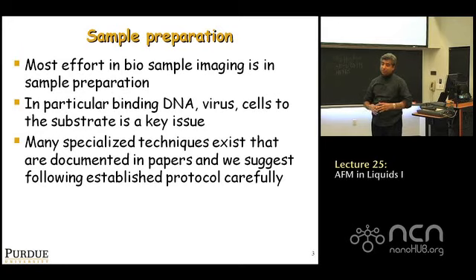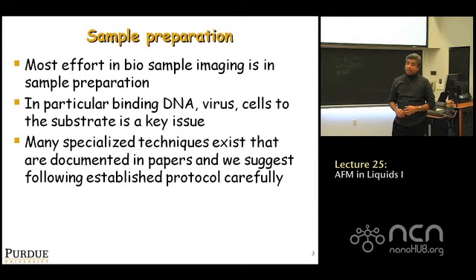It itself will take at least a whole lecture to put together, because what I want to emphasize is that the physical mechanism, so if you look at the ways of binding a biological sample to a substrate, there are, just for DNA, for example, depending on the kind of DNA you're choosing, half a dozen or a dozen different ways of doing this.